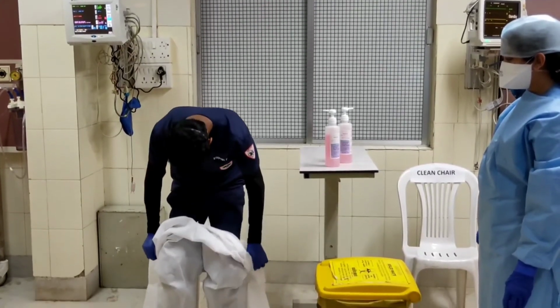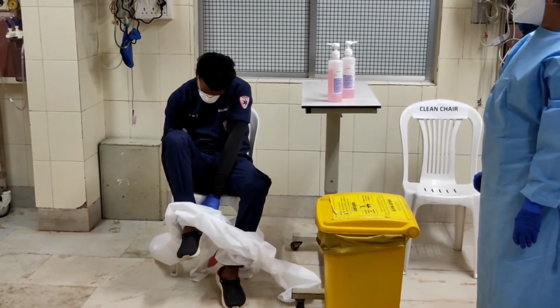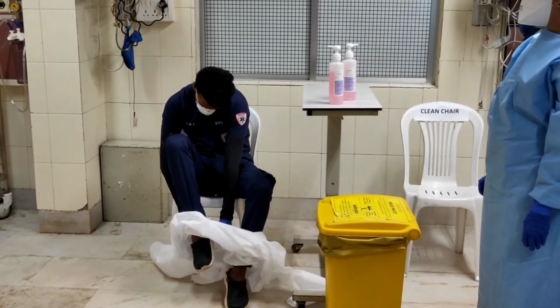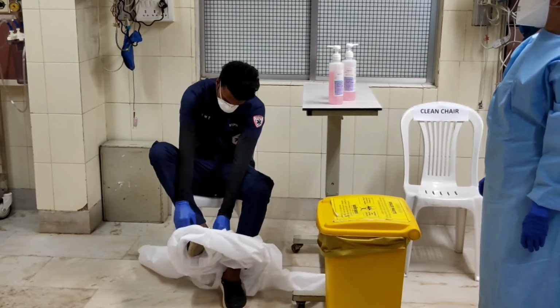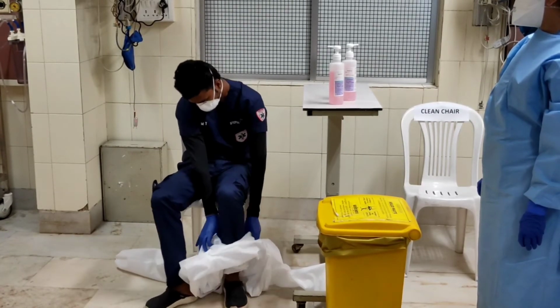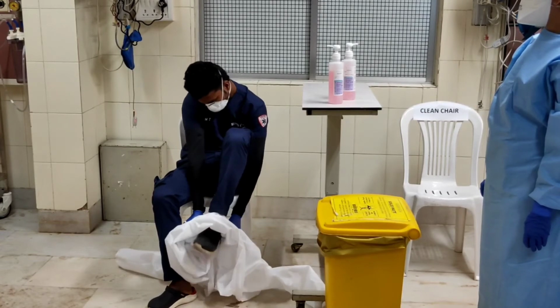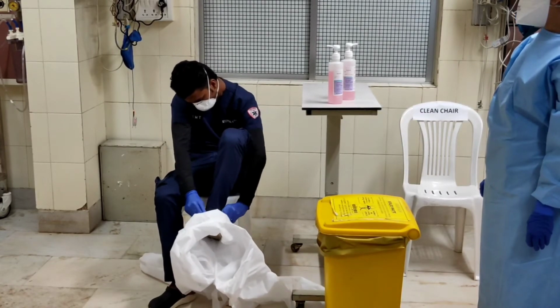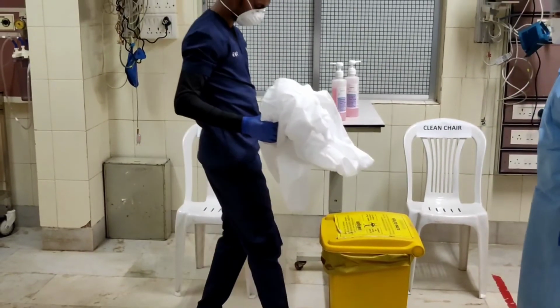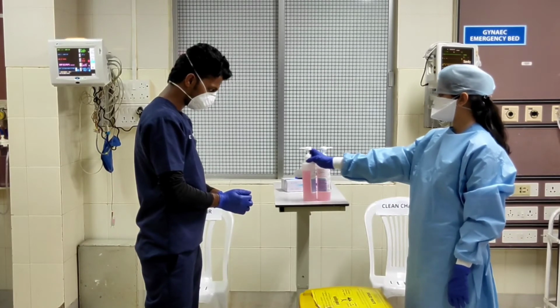Now remove the other part of PPE by sitting down and slowly remove the PPE gown from your body. While removing the PPE gown, make sure the outer contaminated part of PPE is not touching any of your body parts. Once the PPE is properly removed, bundle it up and dispose it into the biohazard bin. Again, sanitize your hand.